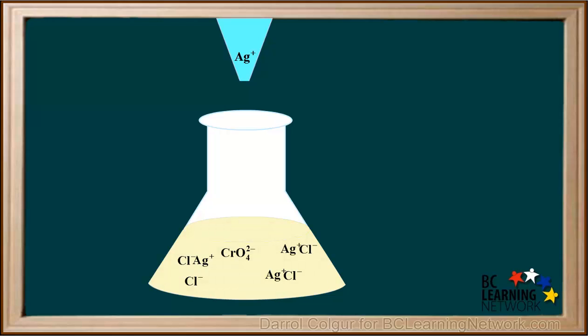The solution will turn red momentarily as more silver is added, but as long as chloride is still present, shaking the flask will make the red color disappear.